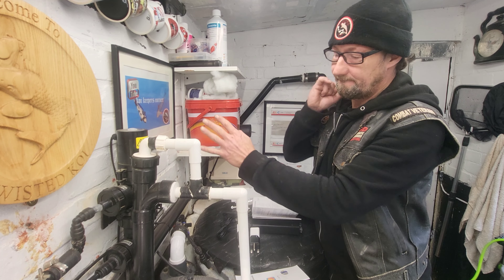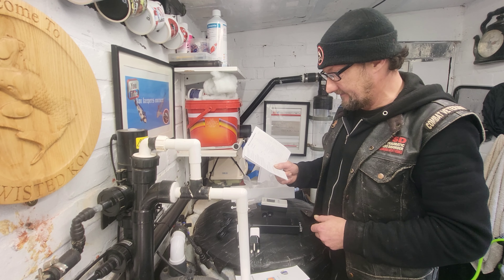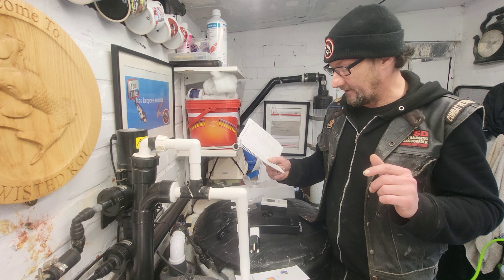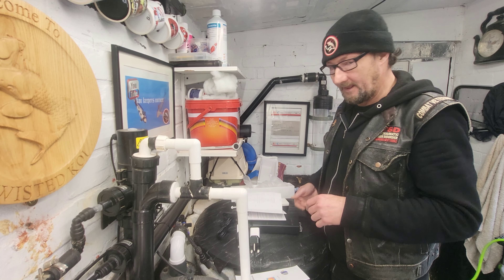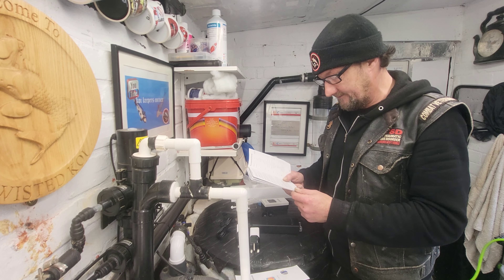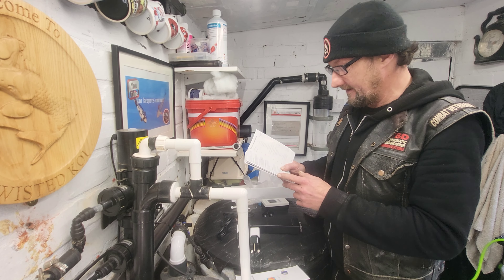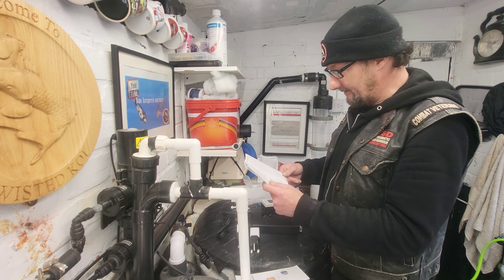Number five: specific gravity. The specific gravity of fish tank water is the ratio of its density to that of pure water, commonly used to measure salinity or dissolved substance concentration. Number six: TDS - total dissolved solids. TDS refers to the total dissolved solids in the fish tank, usually expressed in ppm (parts per million) or mg/L, measuring dissolved minerals and organic and inorganic compounds. Number seven: ORP - oxidation reduction potential. ORP measures the oxidation reduction potential in the aquarium, also known as redox potential, reflecting the oxygen content and purity of water.